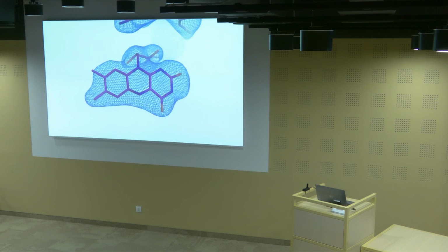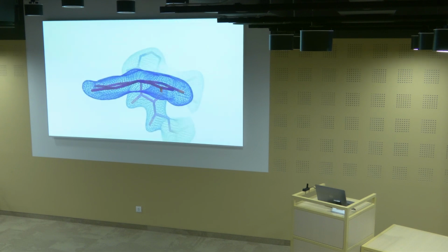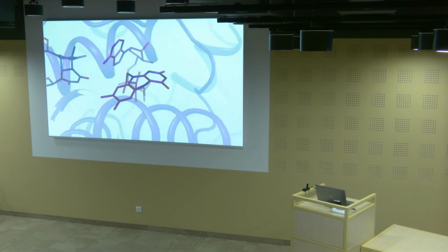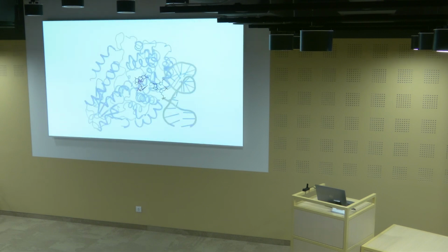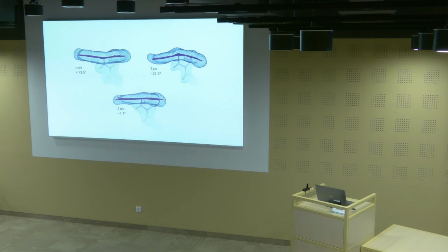And so what we can see is that there's this kind of butterfly bending of the flavin where it moves from an upwards geometry. I have it on the next slide. In the ground state, like this. It depends which way you orient it, but to me it's upwards. And that's a well-known feature for fully reduced flavins, that they have this characteristic bend in many, many flavoproteins, to kind of an inverted one.